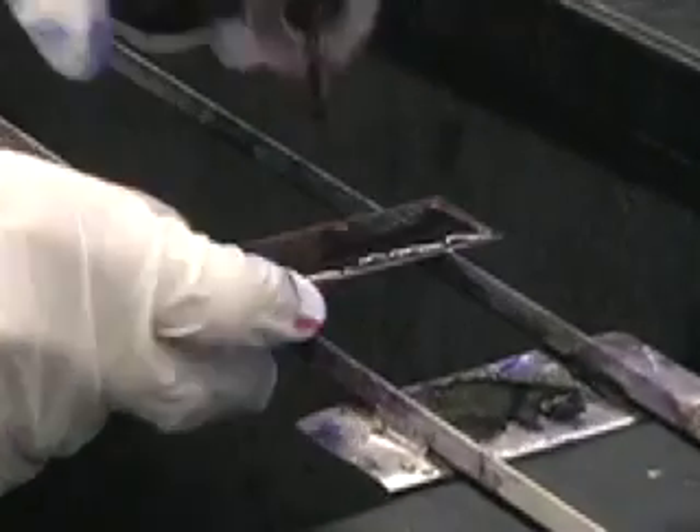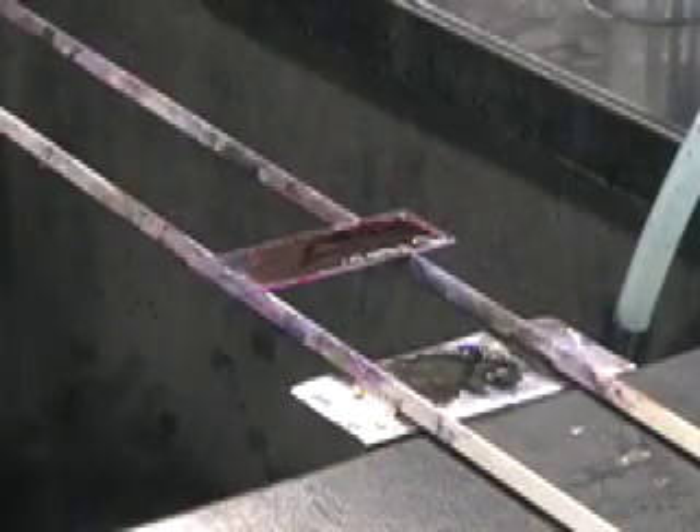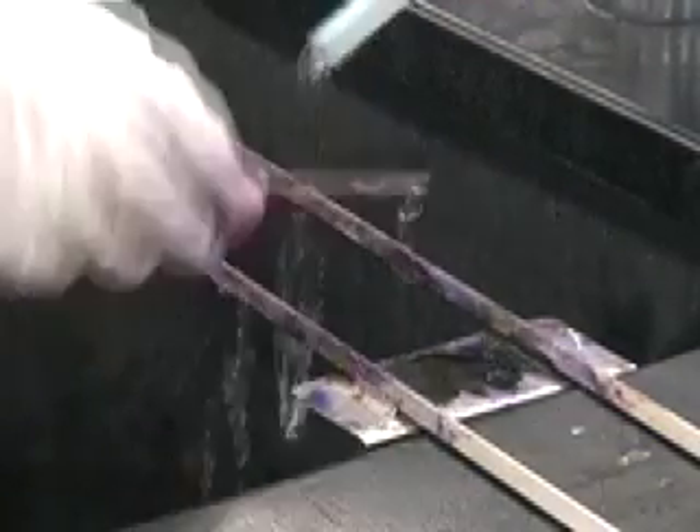It's called a counter-stain because it's the second stain that you use. Leave the counter-stain on for a minute. Now that the safranin has been on a minute, you'll rinse the slide with water.